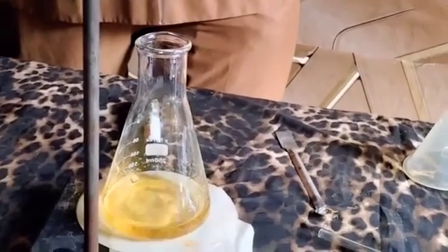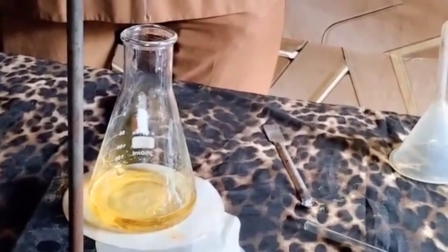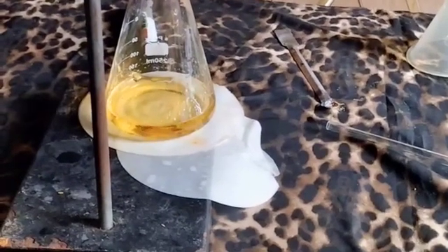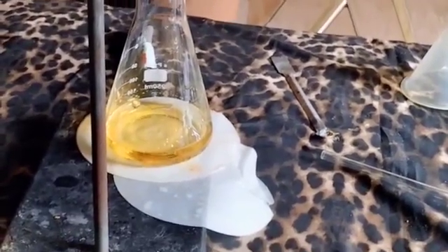At 25, I have to stop the tap. As I stop it now, I like to go drop by drop, let one drop at a time. You see the way it's going? One drop at a time. So gradually another drop, because one drop is about 0.1 cm cube. Okay, so that is all right.